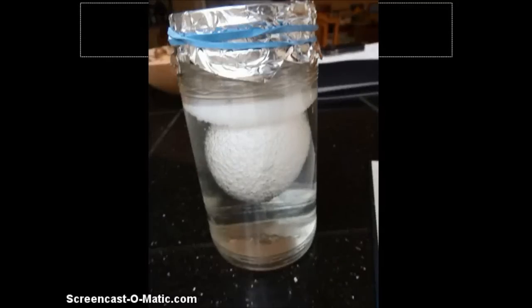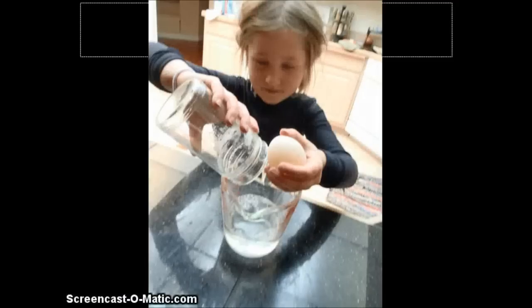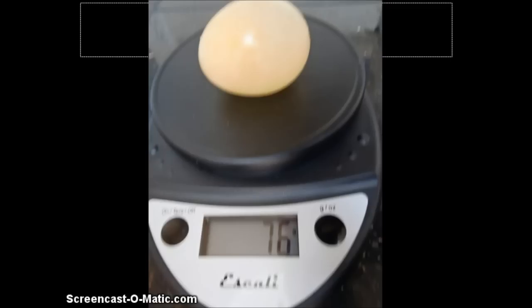Lots of gas. Pour off the vinegar. Gently peel off the shell, which is no longer rigid. Weigh the egg without the shell. What happened to the mass of the egg? How do we explain it?